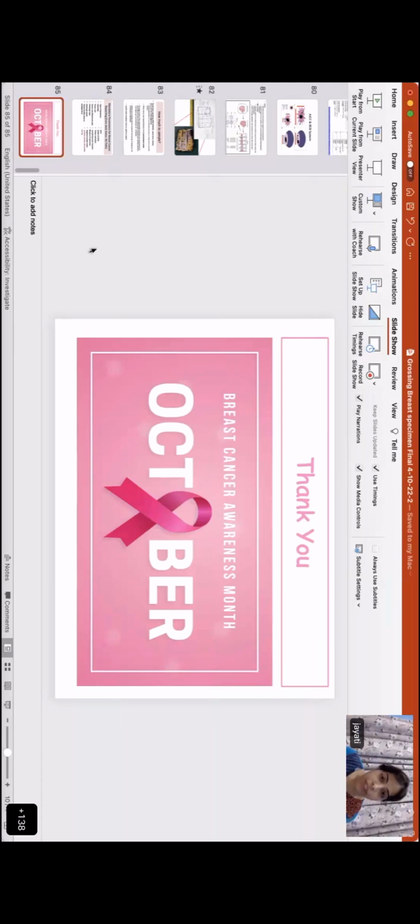Next question was, in case of previous excisional biopsy followed by mastectomy, which tumor sites should be used for staging? In such situations, we cannot stage it on the T size once the excision is done, because in the excision, if the tumor is reaching the margin, then it was not the complete size of the tumor.